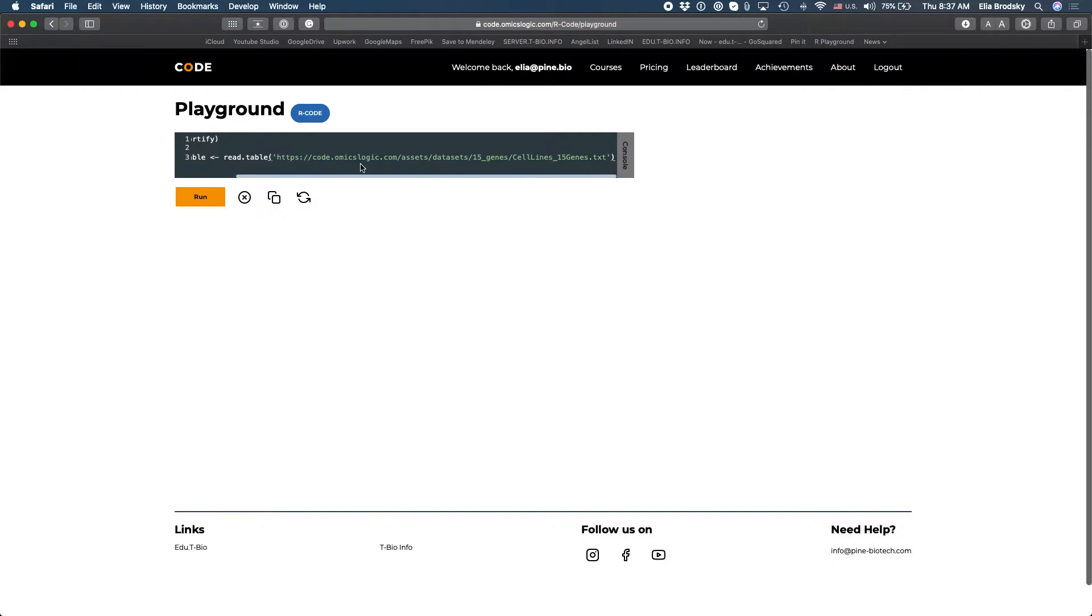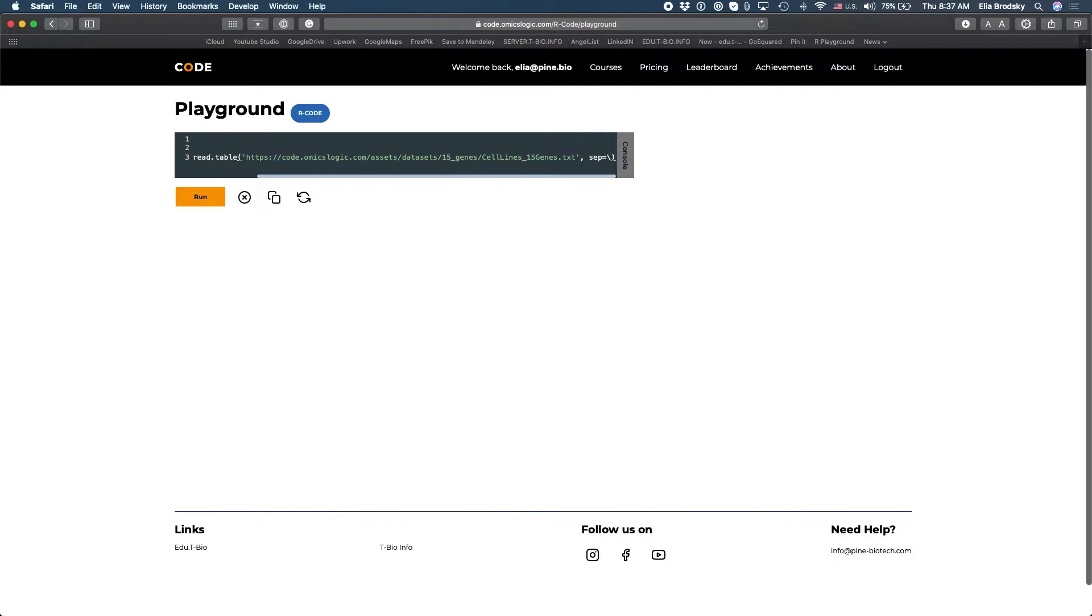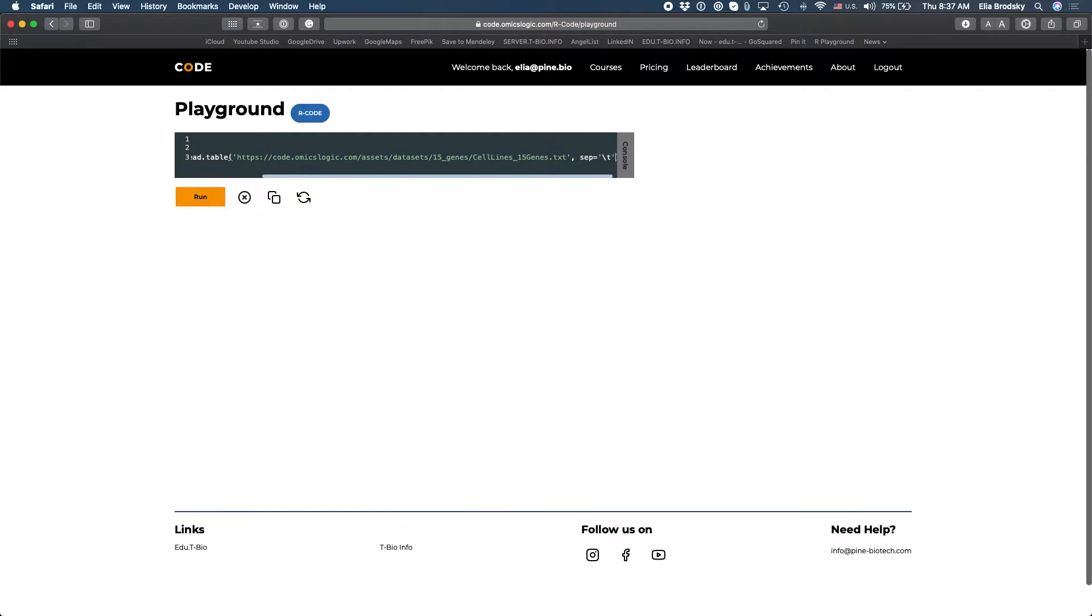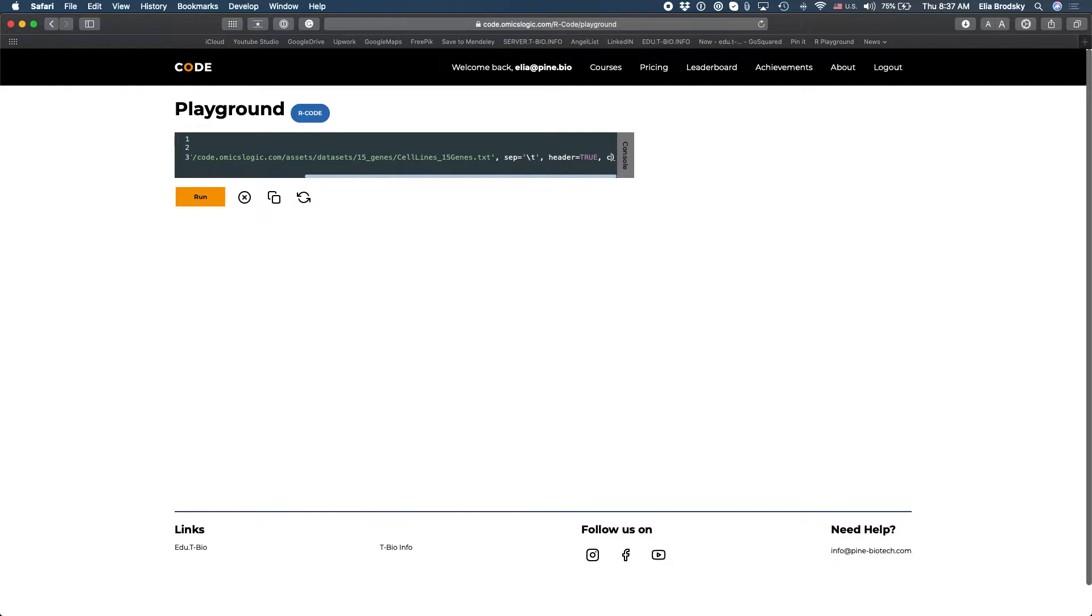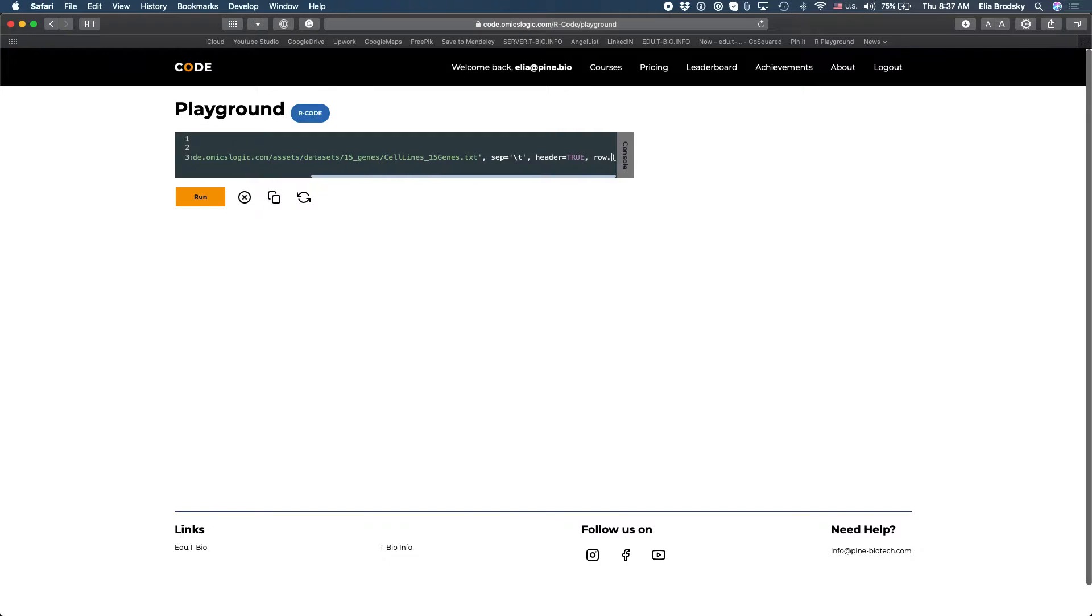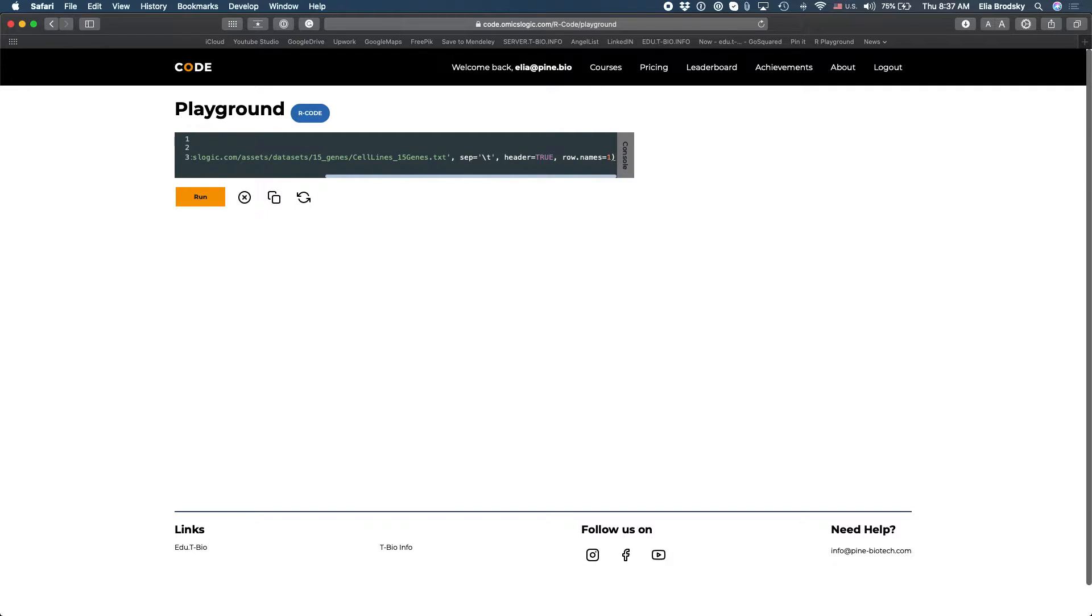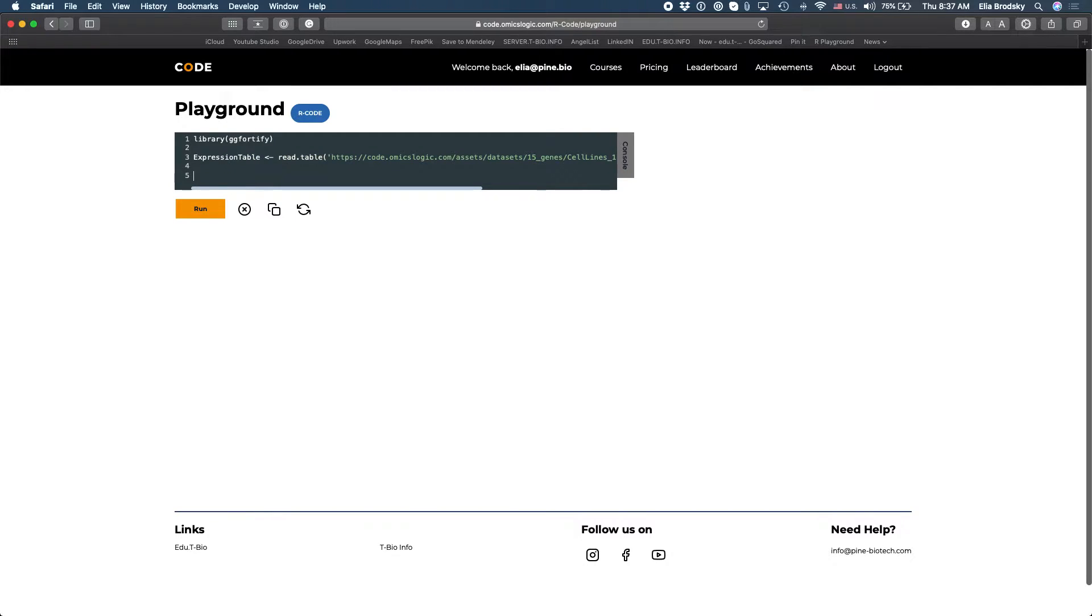It's a tab delimited file so we have to add here sep equals t and we'll also add header equals true, check name, and let's take also row names equals one so that will save our header and the row data separately from the actual data frame.